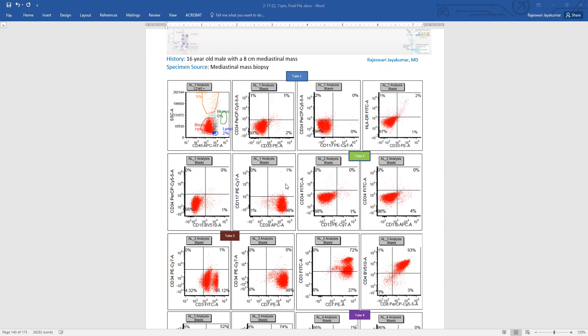They are positive, brightly positive for CD38. They do not express CD13, no CD11B expression. They do express CD3 and they have bright CD7 expression and they are double positive for CD4 and CD8.